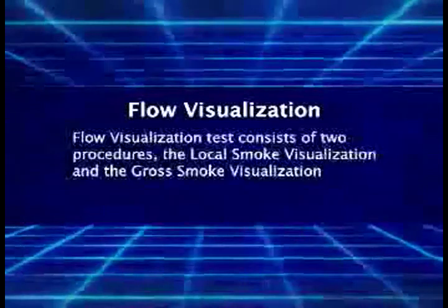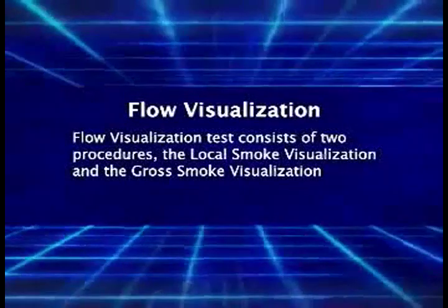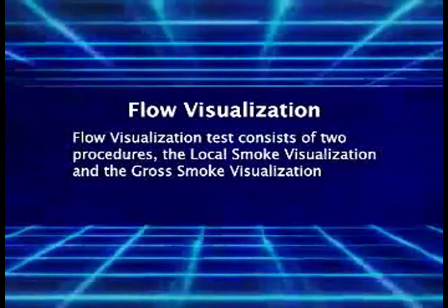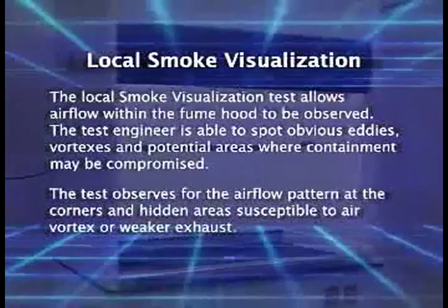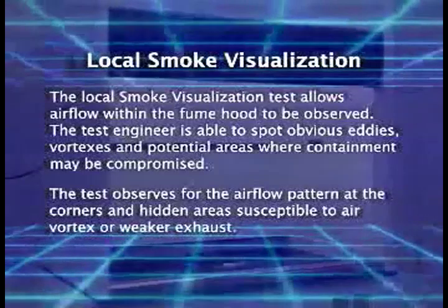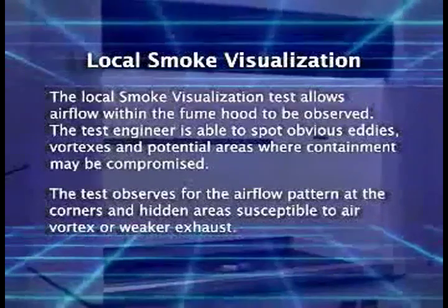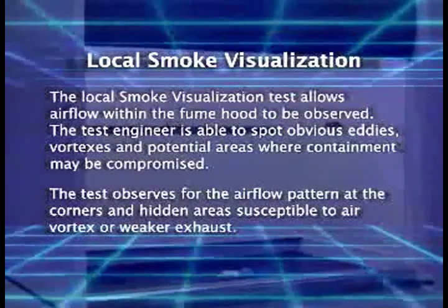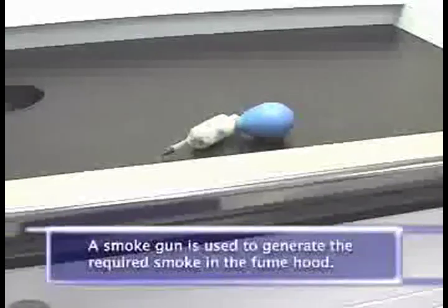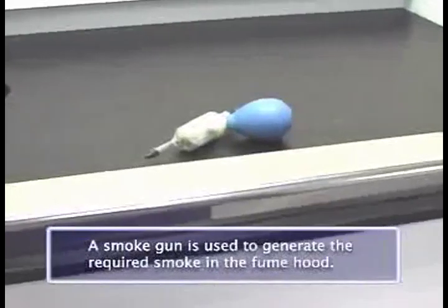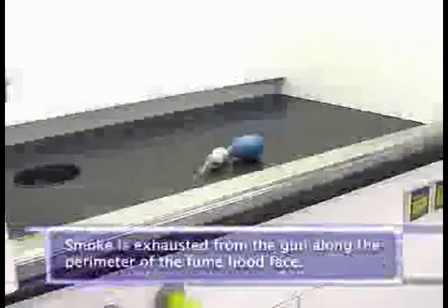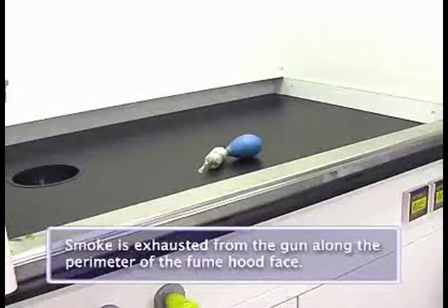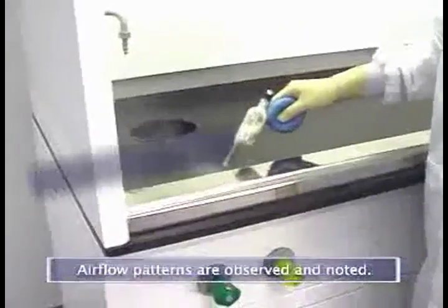Flow visualization tests consist of two procedures: local smoke visualization and gross smoke visualization tests. In the local smoke visualization test, the fume hood is observed as it is typically used. Areas that are susceptible to air vortex or weaker exhausting, such as the corners, are closely observed during the procedure. A smoke gun is used to generate smoke along the perimeter of the fume hood face, and all airflow patterns are observed and carefully noted.